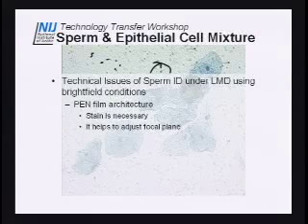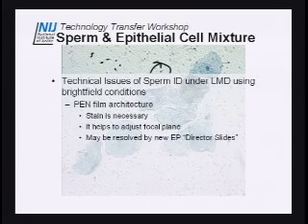One of the things that you can do when you're working on the microscope and trying to see, is that a pore or is that a sperm head, is you can adjust the focal plane to identify your sperm, and you probably do that also normally in your sperm ID. And again, I said there's these new slides we're going to try out. They're very clear EP director slides.